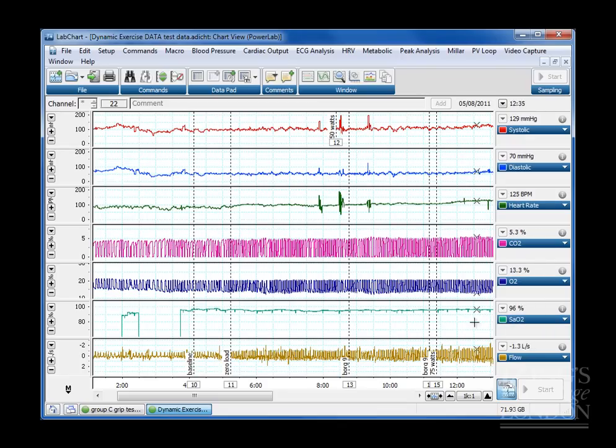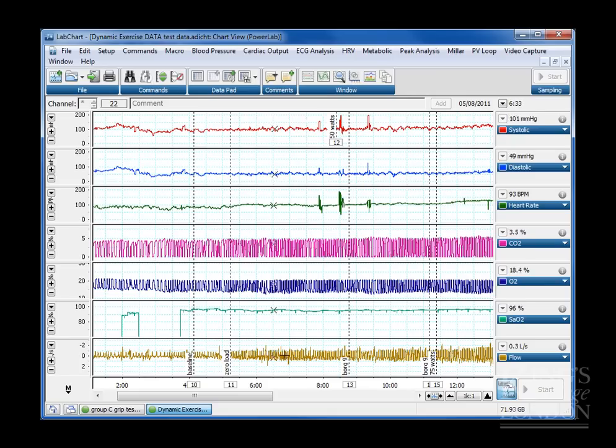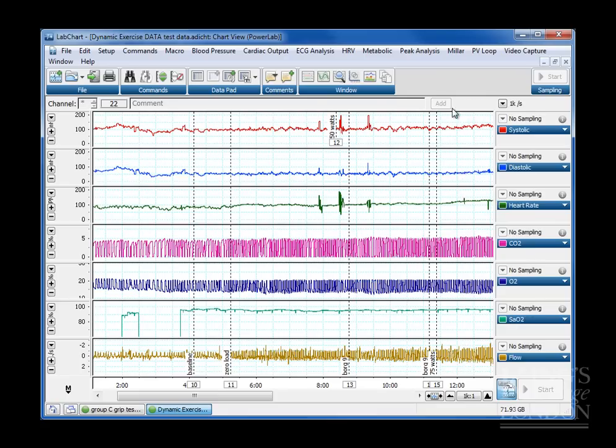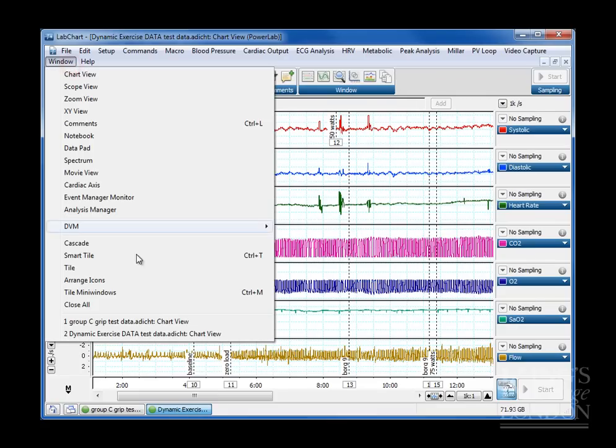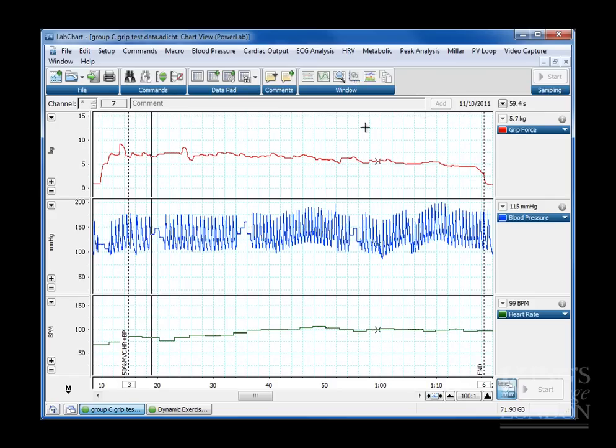We've got oxygen saturation SAO2, which is taken from a finger sats monitor. And then down the bottom here we've got respiratory flow which is taken from a spirometer. So here's all the numbers we have for this data set. But we'll start with the simple data set, looking at the grip test, and we'll go on to the next tutorial and looking at navigating round files using these data.